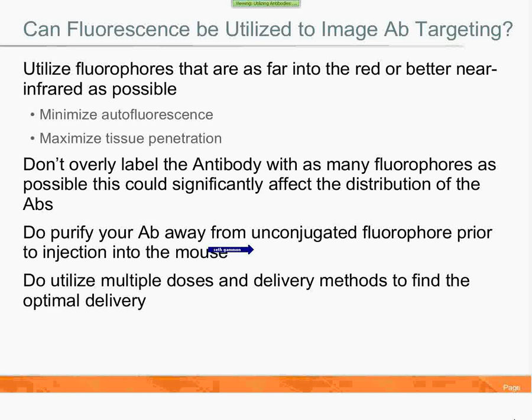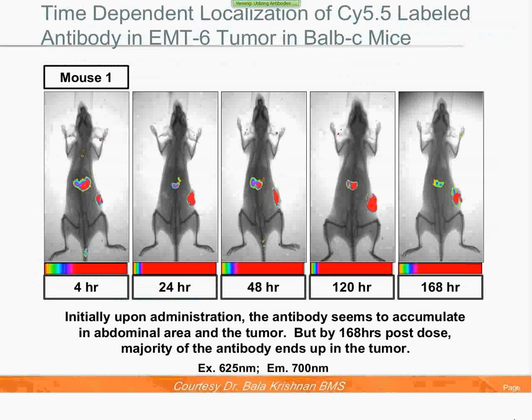And indeed, one has to wait many days in order for the tumor to really be significantly distinct from the liver. So again, this is the big advantage of a fluorophore versus a radiotracer, in that you don't have to match it to the half-life. This fluorophore is fundamentally just on all of the time.